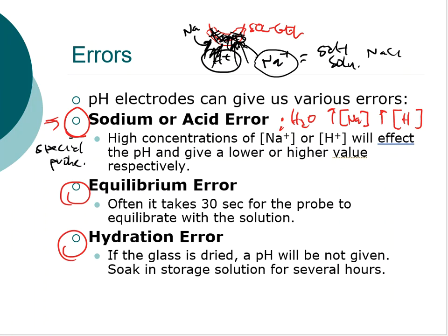There's nothing we can do to fix those problems unless we order a special probe for that application. For example, in the food industry with heavy salt concentrations, you may need a special pH probe that can handle high sodium. The same applies in strongly acidic environments, like companies using chromic acid or sulfuric acid — those require a correct probe with the right range to accurately measure those solutions.